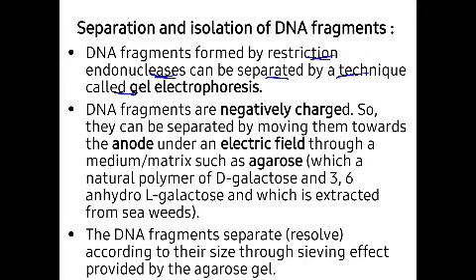Okay, after separating, we have to isolate it, the required DNA fragment that we need, we have to isolate. So this separation and isolation of DNA will be conducted by a certain technique. For this we need a special, very sophisticated technique, that is known as gel electrophoresis.